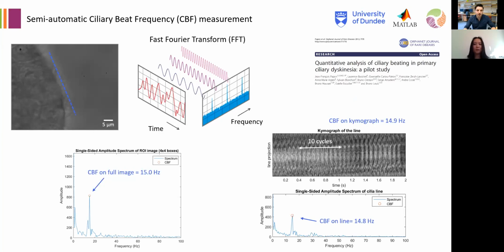I'm aware of the work that was done in France, and a couple of papers that I talk about in my presentation. There is a lot of talk about how pattern, even a qualitative description of pattern, is somewhat better than CBF alone.